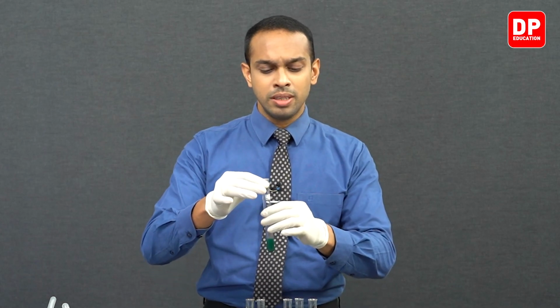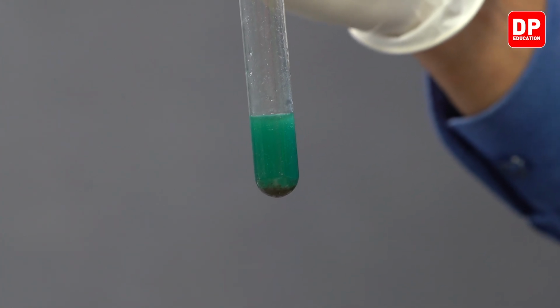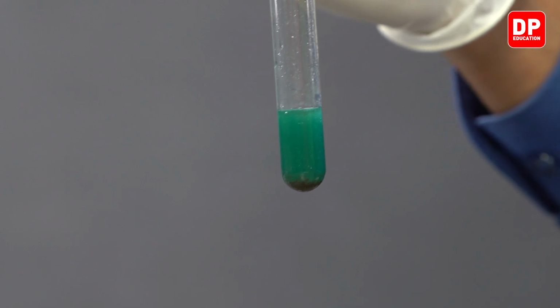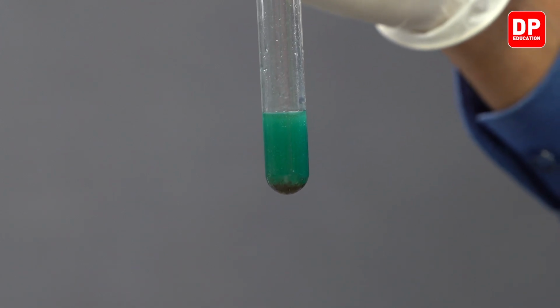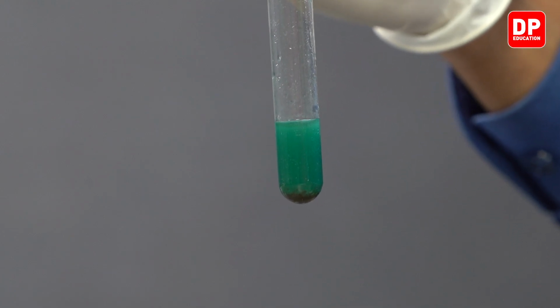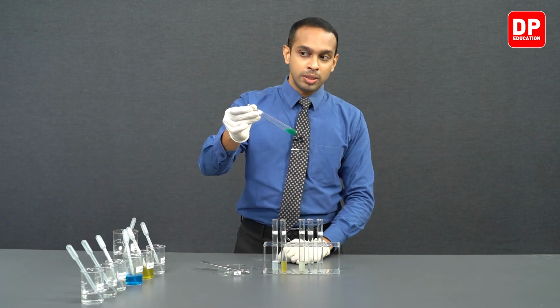What about copper? Copper is not a very reactive element. So magnesium is a very reactive element, and you can very clearly see that copper has reacted with magnesium. Copper 2 plus ions in the medium have gotten displaced as copper solid. We can see at the bottom of this test tube a brown color precipitate.